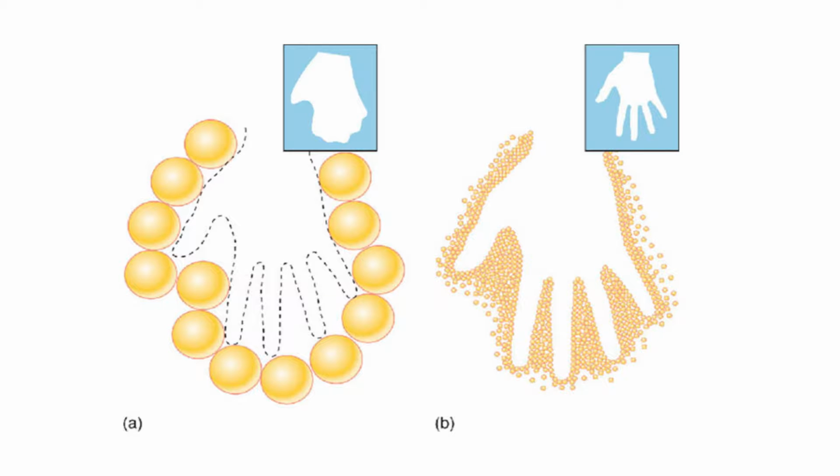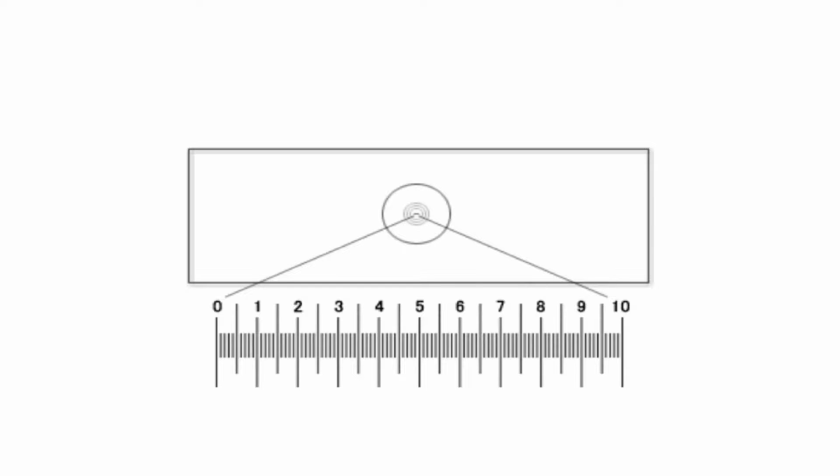So the other thing we do in exercise 2 is take measurements of the organisms we're looking at. Typically, to take a measurement of an organism, you need to calibrate the little ruler that's in the ocular lenses. You do that by having a stage micrometer that you put onto the scope. You use the tiny ruler in the stage micrometer to measure the distance in the ocular micrometer. Because relative distance is going to change each time you change the magnification by changing the objective lens, you have to calibrate or measure this ocular micrometer at each different magnification.